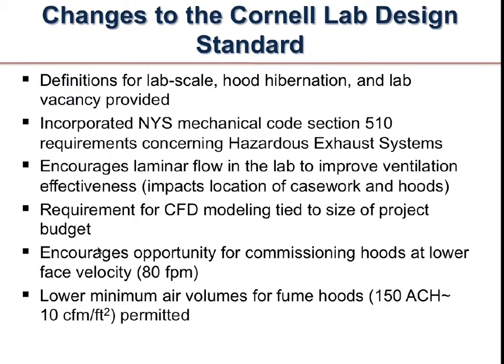And we needed to define that this design standard only meets the need of lab scale work, of lab scale renovations and building renovations or new building construction, so that when we have a researcher that needs to move up to pilot scale, we need outside expertise, and that the cost is going to rise. We needed to define that.